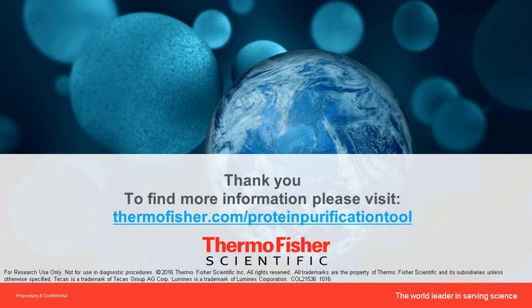In this particular process, we looked at different elution buffers. But if you want to get the antigen off the antibody, about 20% of the antibody will leach into the eluate. However, since we are doing liquid chromatography separations before detection in a mass spectrometer, antibody fragments after digestion don't interfere with the identification of the target. We have done a lot of IP-MS samples, and we have never seen the antibody create any issue with the LC-MS analysis.